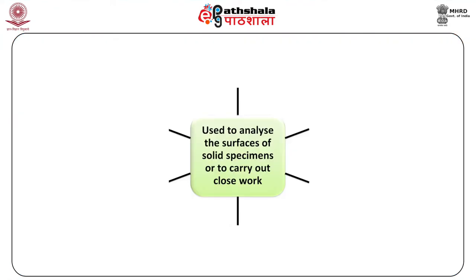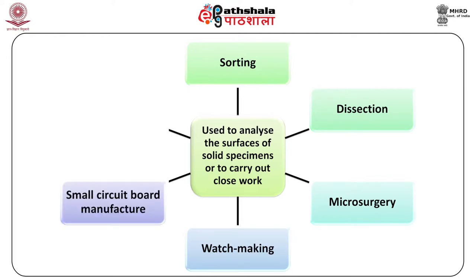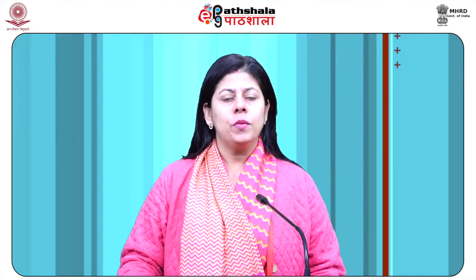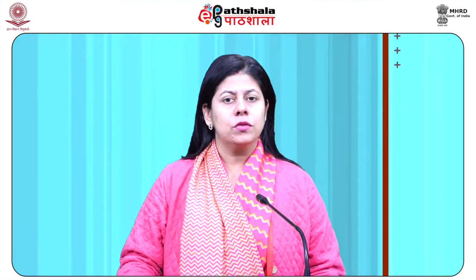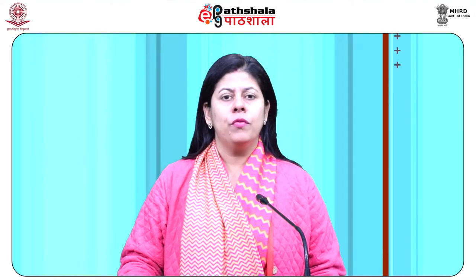The stereo microscope is frequently used to analyze the surfaces of solid specimens or to carry out close work such as sorting, dissection, microsurgery, watchmaking, small circuit boards, manufacture or inspection, etc. The stereo microscope should not be mixed up with a compound microscope fitted with double eyepieces and a binoviewer.